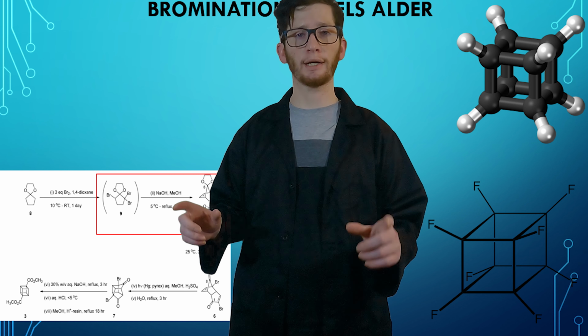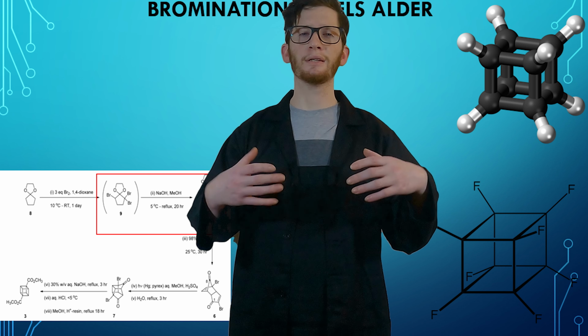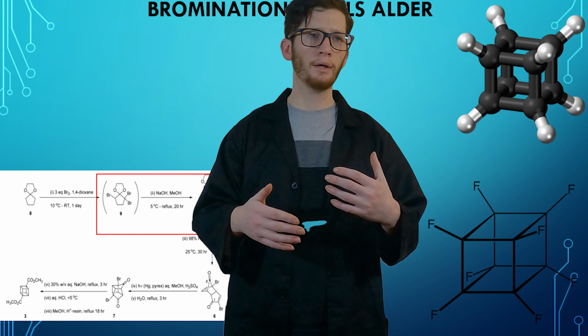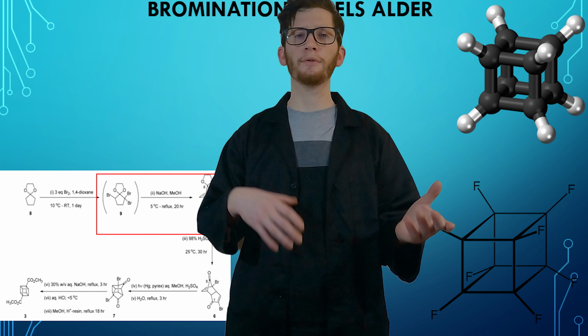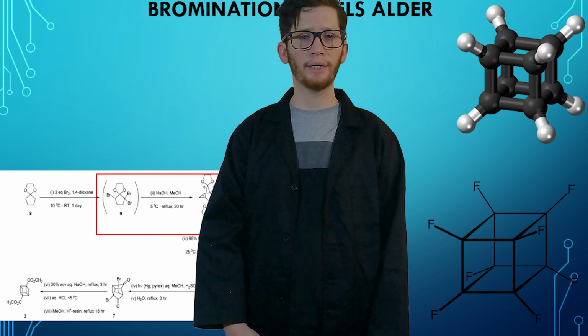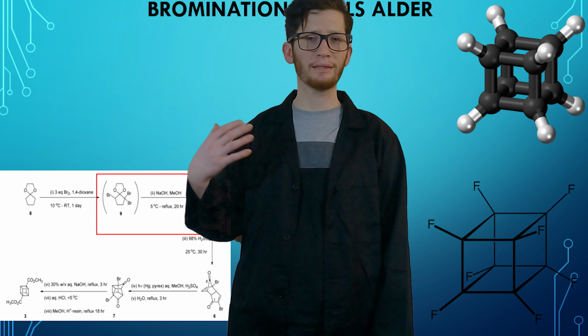We're gonna fully deprotect our molecule because, like I said, at this point we have strayed away from what other people are doing, and we're following more of a newer procedure from 2020 and just speculation as well. So we'll take a different path. So that should be exciting. The step after the Diels Alder, it's just sulfuric acid. It's not gonna be that hard.